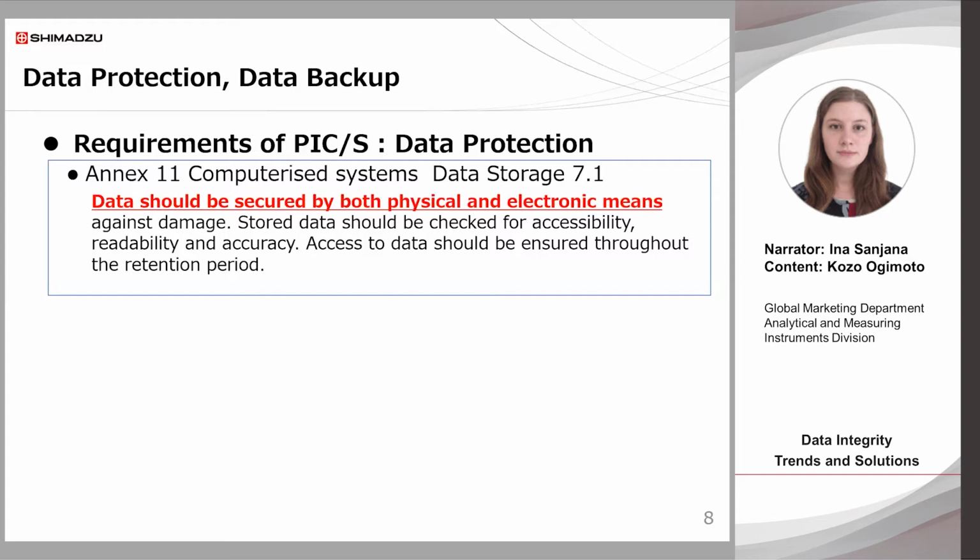And how can we protect data from damage electronically? If the data is stored directly in a Windows folder, anyone can accidentally change or delete the data if they can log on to the computer. The data is not protected. On the other hand, by managing data using a database, etc., you can avoid deleting data by mistake. This is just one example of how to protect your data electronically.